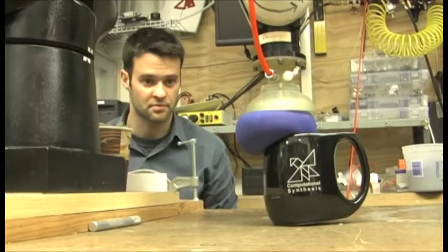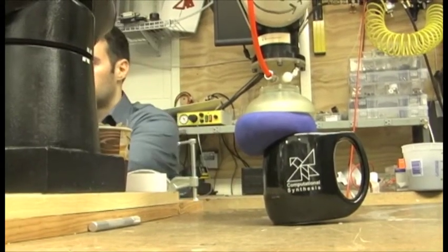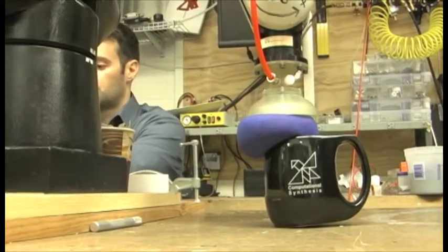A robotic gripper is an end effector, so it's something you put on the end of a robot arm that helps it pick up whatever item you may want it to pick up.